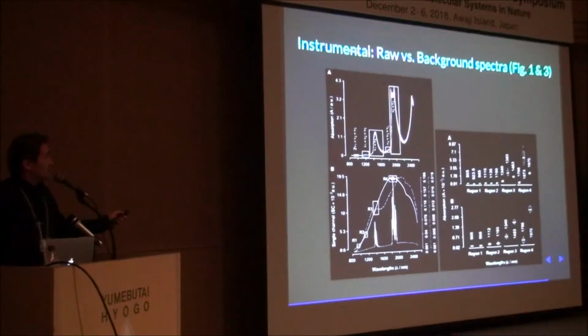Last but not least, this is the instrumentation variability. So what I'm basically showing is the raw near-infrared spectrum with all the assignments, and these are the background spectra. These are the spectra taken without cuvette, without sample, just air, the vapor present in the environment. So we want to know what the variation there is. And with this experiment, we also had 1,000 spectra of background.